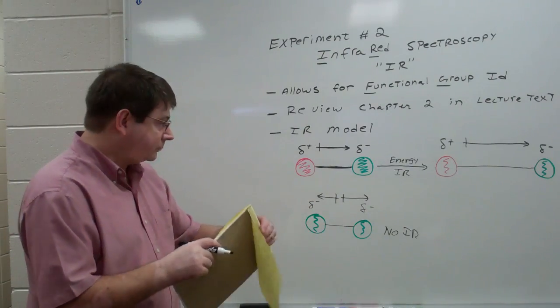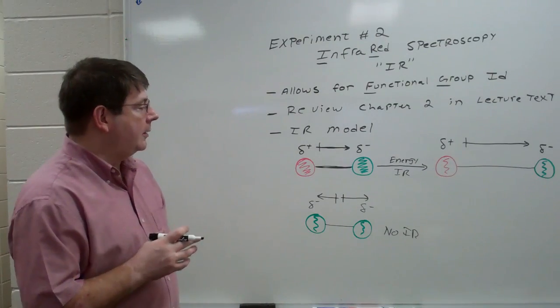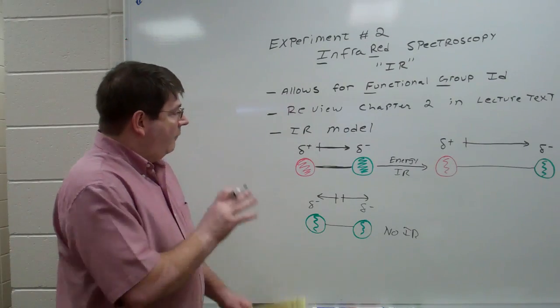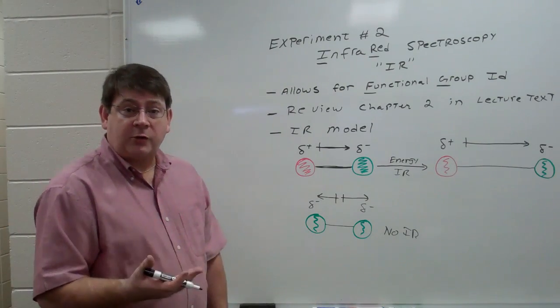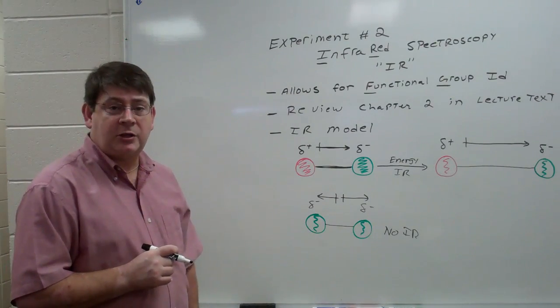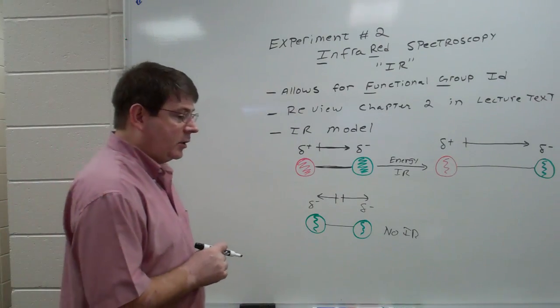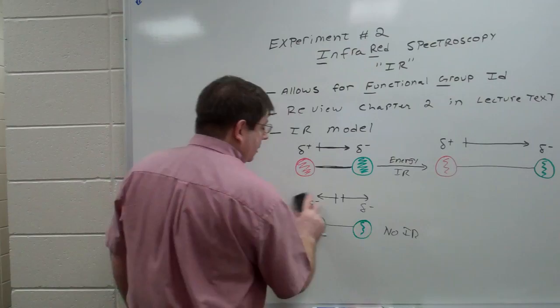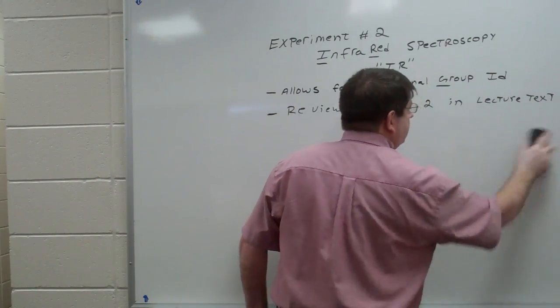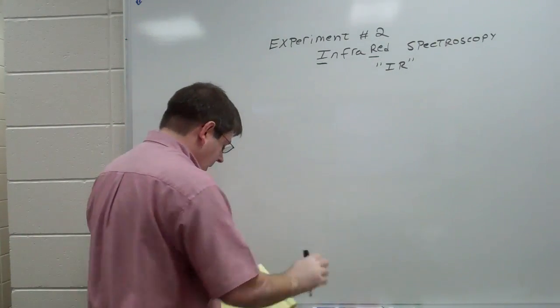So that's kind of in a nutshell how IR spectroscopy works. So we've got to have that change in dipole moment, and we can observe the absorption of the IR energy using an instrument known as an IR spectrometer. Okay. Fortunately for organic chemists, it turns out that all functional groups that we're interested in anyway, when stretched, will result in a net change in dipole moment, and so we can actually observe these by IR quite easily. And so this is a very nice technique for observing and identifying functional groups in an organic molecule. Fairly straightforward manner you're going to learn about in lab.